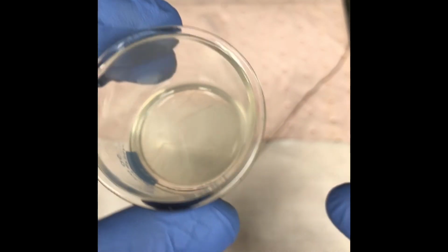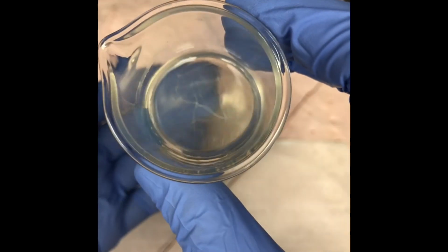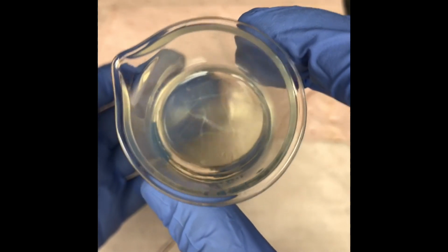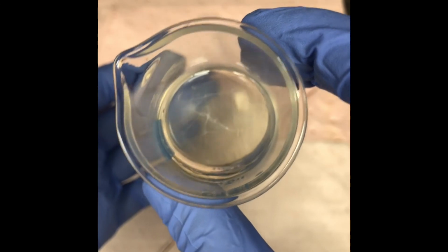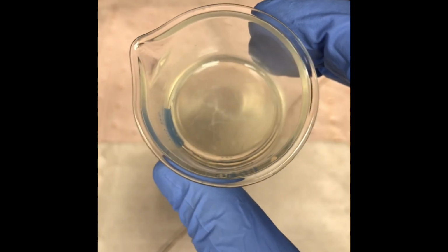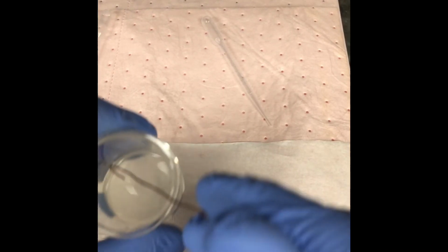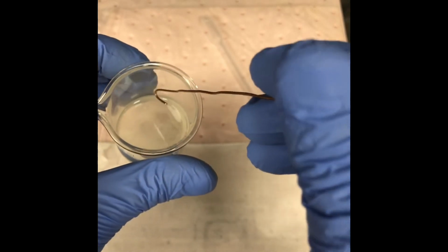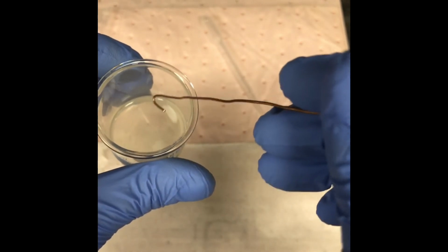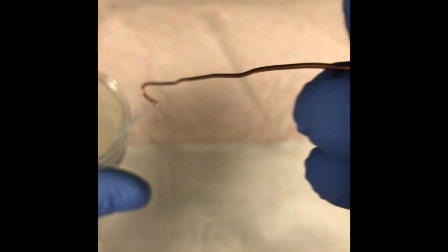I'm hoping you can see that there's a beginning of formation of some strands. See the strands here forming? All right, so as those form, I will let them form a little longer, and when I get enough of them, I will begin to pull the nylon out and then place it on the paper towel. All right, the nylon has started to form well, and what happens is the nylon actually forms an interface that prevents the two reagents and the two layers from finding each other. So as I pull it out, I'll make more and more nylon. And hopefully you can see that this will be a slow process.